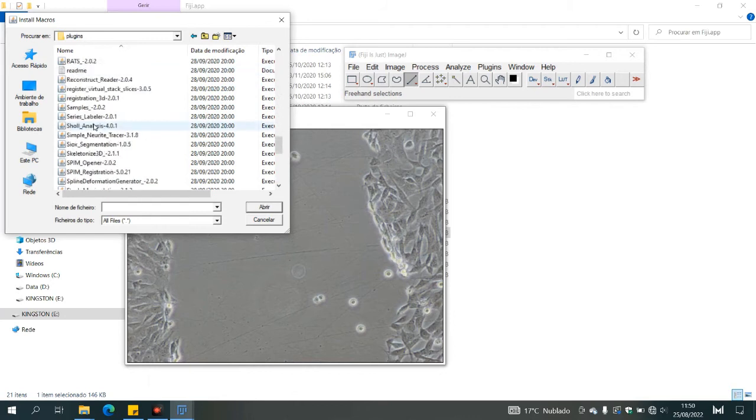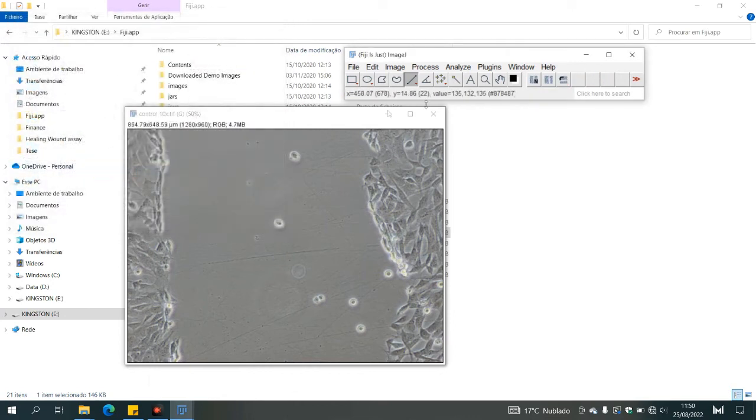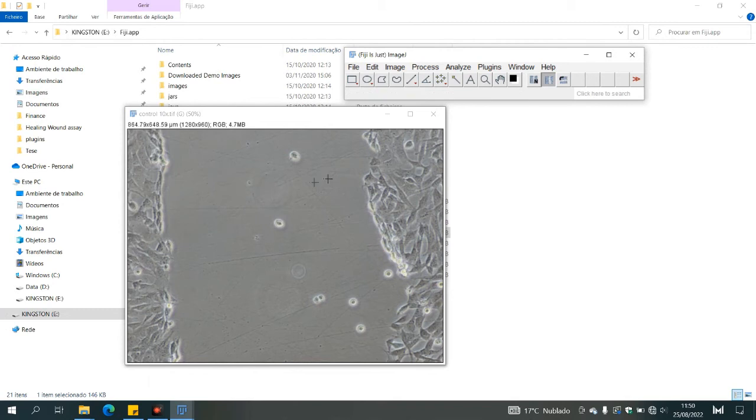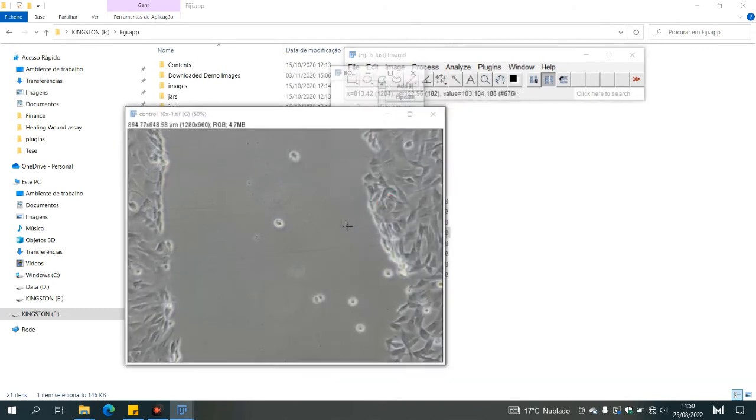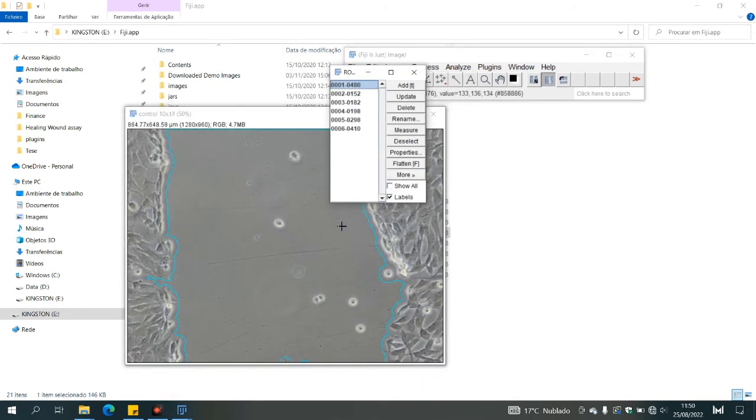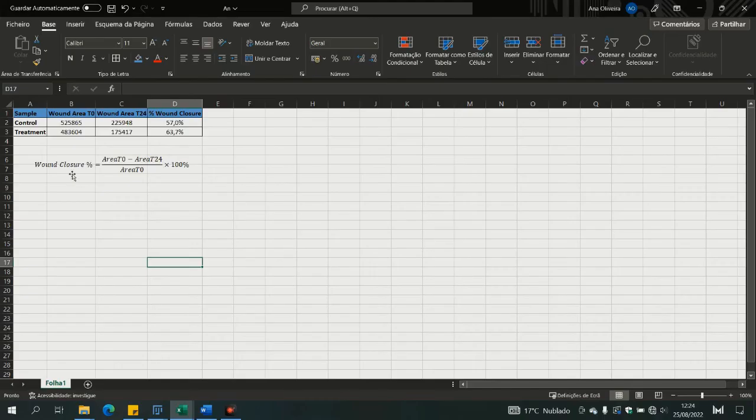It will now show three new icons. Then click on the wound healing assay icon for vertical wounds and on the image. And right afterwards you have the analyzed image as well as the values.